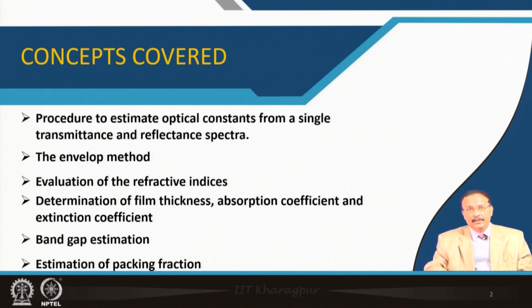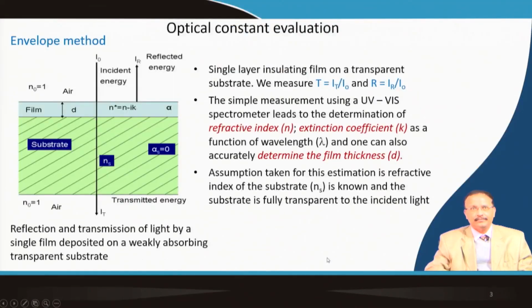Then we can determine the film thickness, absorption coefficient and also extinction coefficient out of this single set of data. This data is also useful to estimate the band gap of the transparent dielectric thin film, and finally, some idea about the microstructure in terms of the porosity inside the film can also be estimated by this powerful tool.